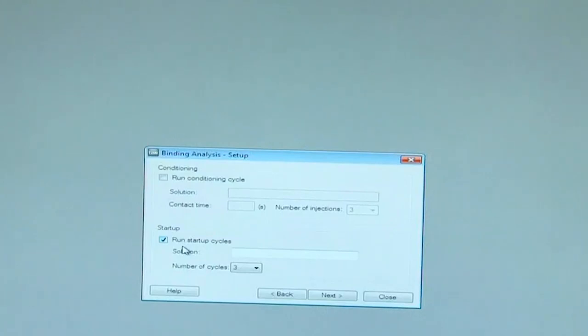Startup cycles are cycles of buffer used for equilibrating the system. Here basically buffer is used as analyte. We can type as HBS-EP-plus buffer. And from the pull down menu, we select three cycles. Generally, for binding experiments, three cycles are selected.